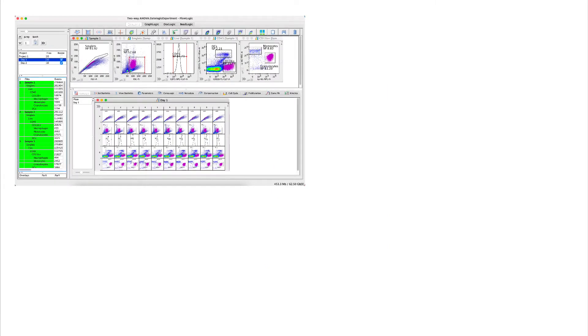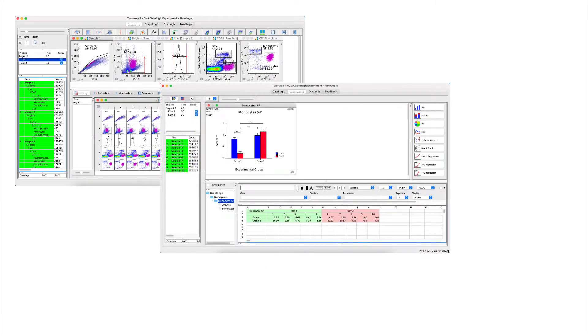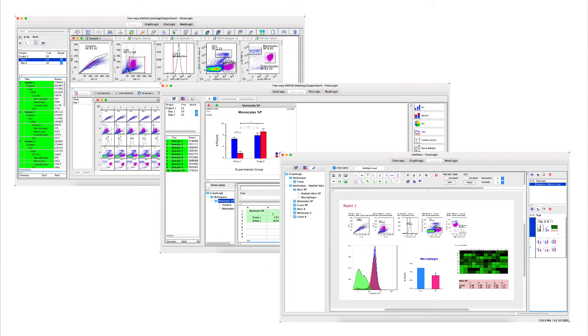Gating, heat maps, graphs, statistical analyses and reports are all linked and update in real time.